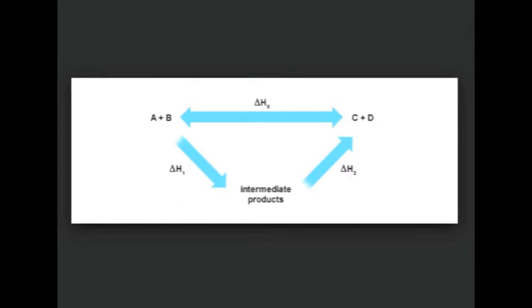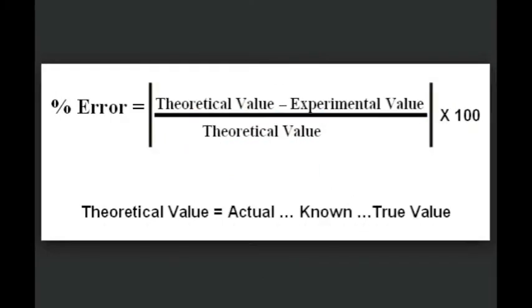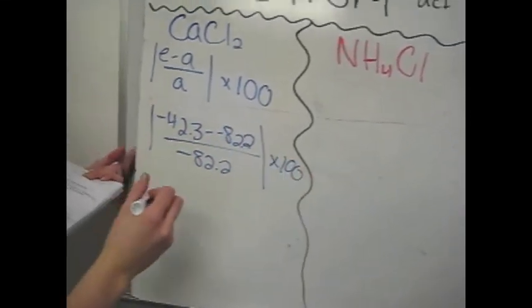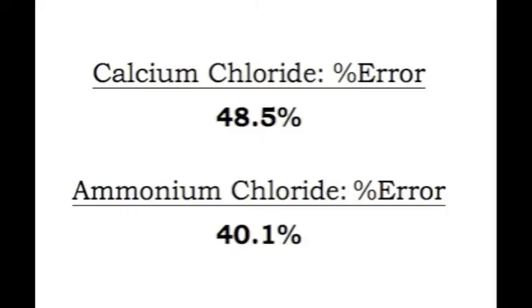In addition, the accuracy of conducting this experiment can be found by calculating the theoretical and experimental change of heat and then finding a percent error. This helps to show how accurate or inaccurate the lab conducted was. Based on the results and the places for error, this experiment should not be used to determine the actual enthalpy change for a solution.